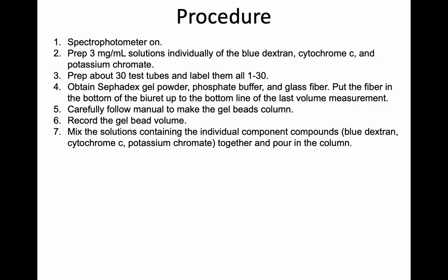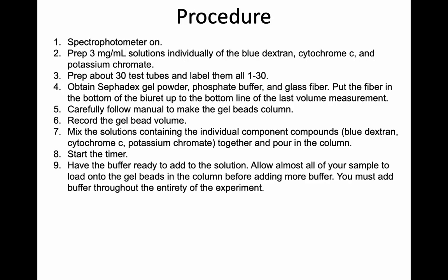And now let's move to the chromatographic process. So first you're going to mix the solutions and pour them in the column. Once you have poured all your solution into the column, you need to start your timer. As soon as you have poured your solution, you are going to add your mobile phase, which is your phosphate buffer.